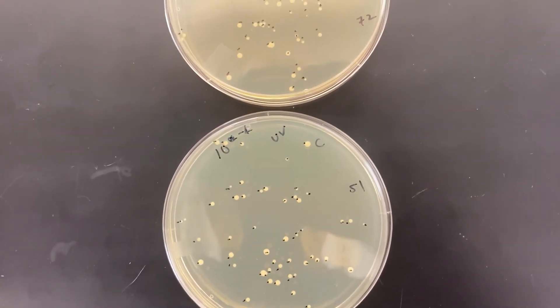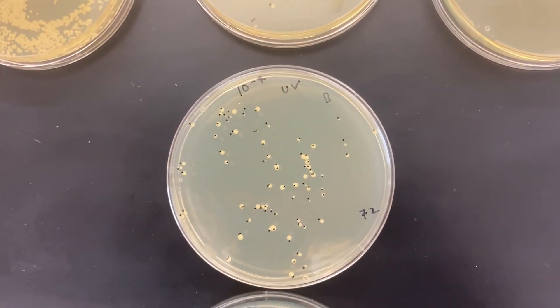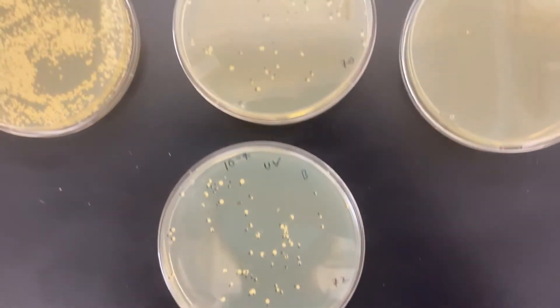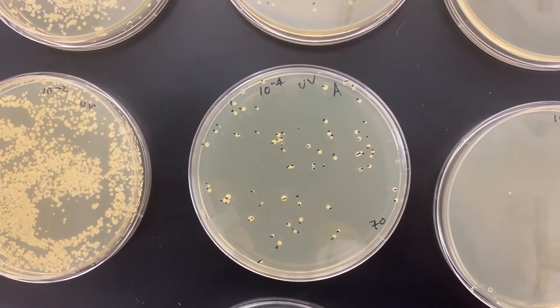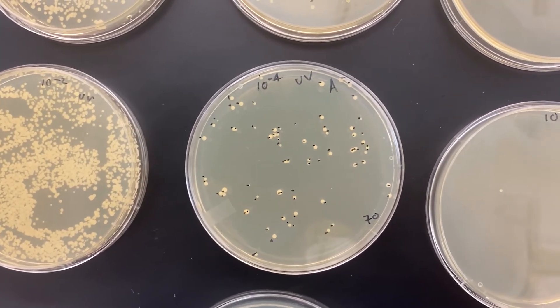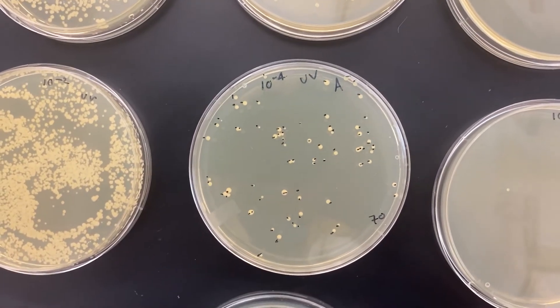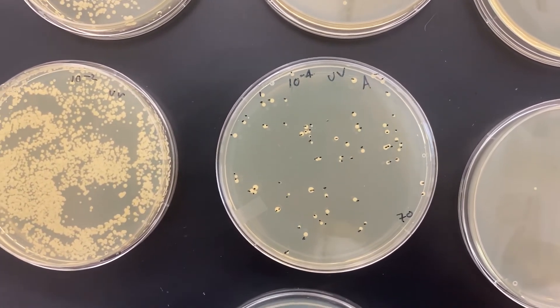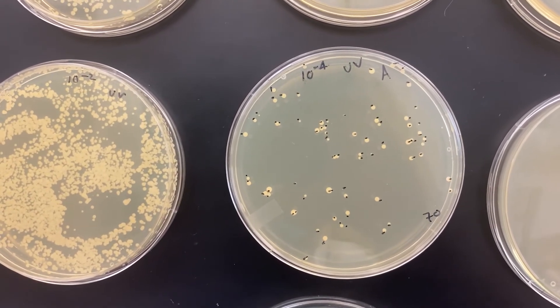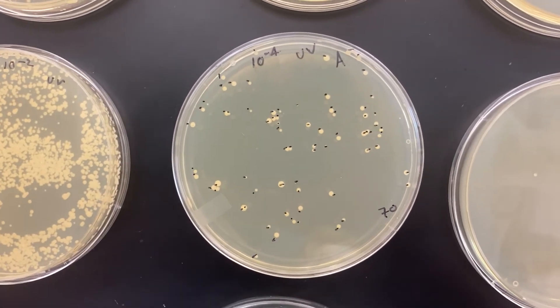You should certainly be able to get there if you're on your way to a career working with cells on petri dishes. We were looking for a difference because these UV plates got zapped by UV light. One possibility after zapping with ultraviolet light is that it actually kills the cells — so even though I expected to plate about 70 cells, they might not have all grown up because they may have been damaged by that ultraviolet light.